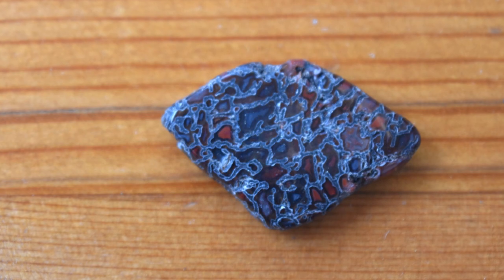Here is a piece of a dinosaur bone. The bones have canals for blood vessels and nerves, and in this specimen they are filled with red minerals. I wonder if the red color actually comes from the red blood cells enriched in iron.